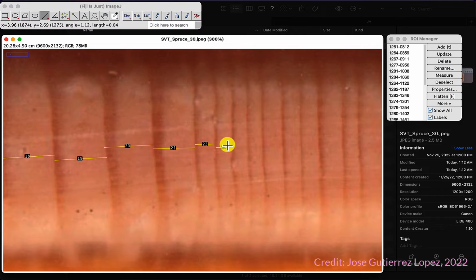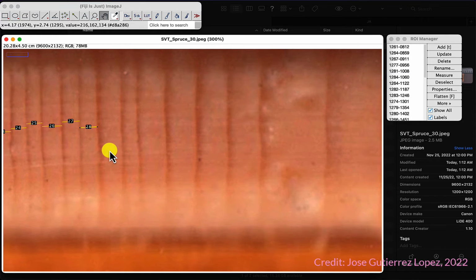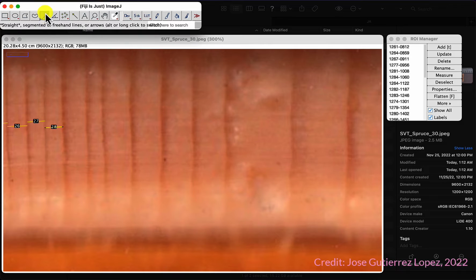Might be worth mentioning that this is not a perfect method. As all of you know, there are many tools and dedicated software for this, with the benefit that you might have access to a reference and might make corrections of your rings maybe easier, potentially. But in this case, the idea is that we're going to use ImageJ, so we're going to have to work with this.